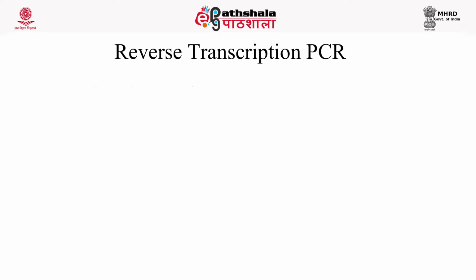After studying PCR and real-time PCR, let us see reverse transcription PCR. Reverse transcription is RNA directed DNA synthesis.